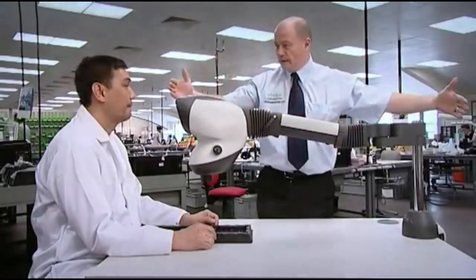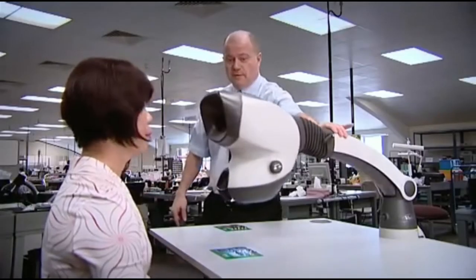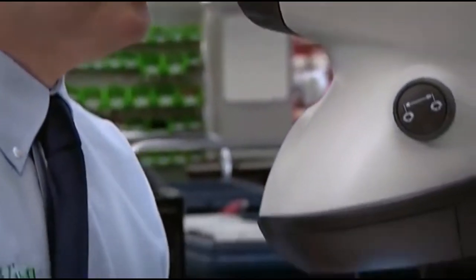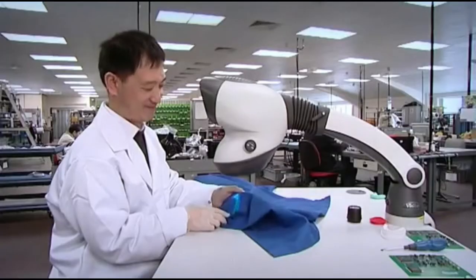Mantis has become the most recognized brand for low magnification viewers in the world. Some of the best-known companies in the world are regular users of Mantis. Our customers value the ergonomics and the unique patented technology of Mantis.